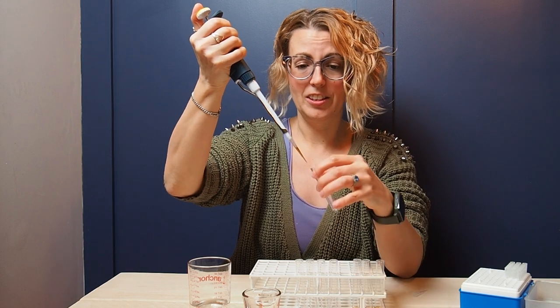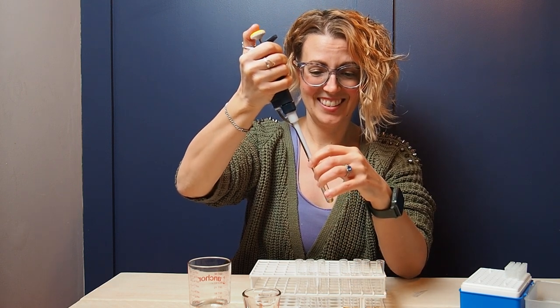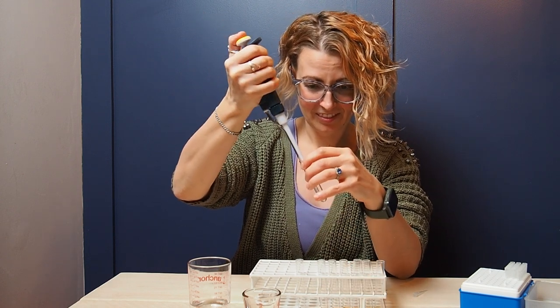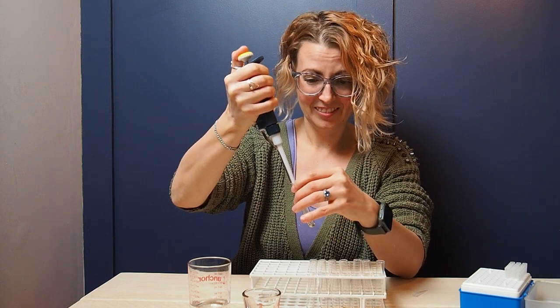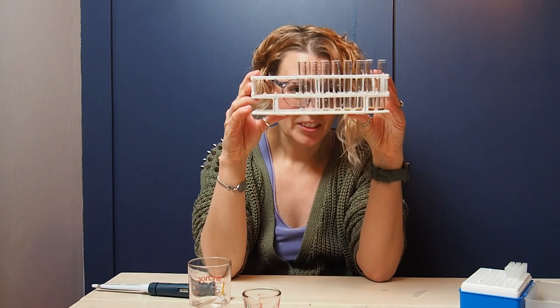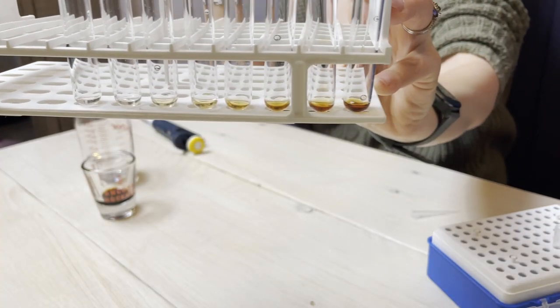All the way down your dilution series, and then your final tip you can just discard. You can see here, from most concentrated to least concentrated, you have a decreasing amount of soy sauce in each tube.